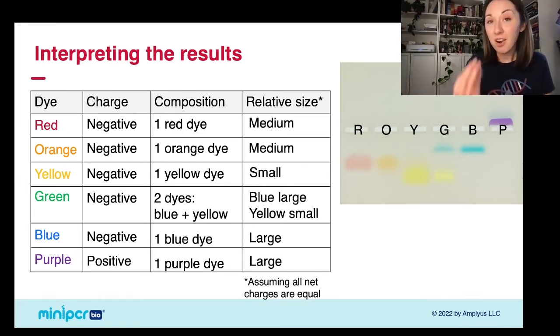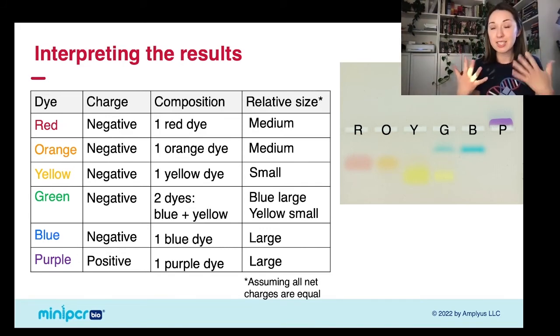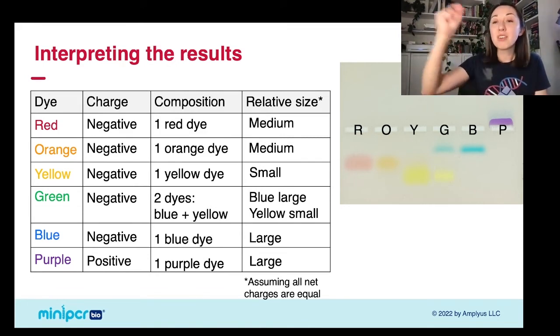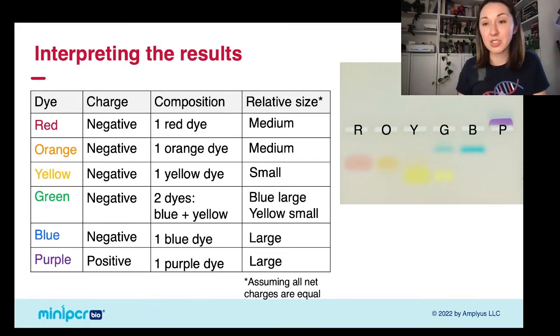Remember, the farther a molecule moves through the gel, the smaller it is. And the larger it is, the more it'll get hung up in that gel. So the molecules that moved the farthest away from the wells are our yellow molecules. Those are the smallest molecules we have. Our red and orange molecules are a little bit in the middle, so they're our medium sizes. And our green, blue, and purple molecules are the closest to the wells, so they are the largest molecules that we have.